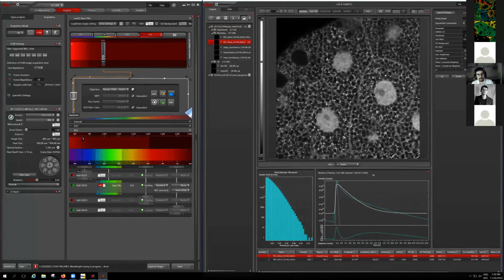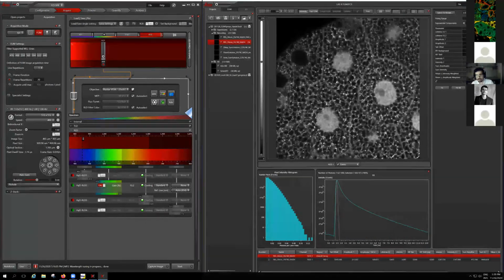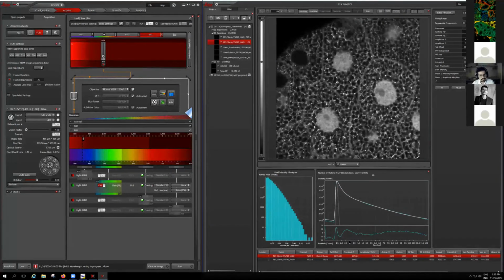So that's the point where I go to the second component and try to find out if it's a double exponential decay. Then I do the fit. And here, again there is a systematic pattern, the residual is not great. So now the question is, do I have a third component, or is there something in my sample which is contributing to the signal but is not what I'm interested in?